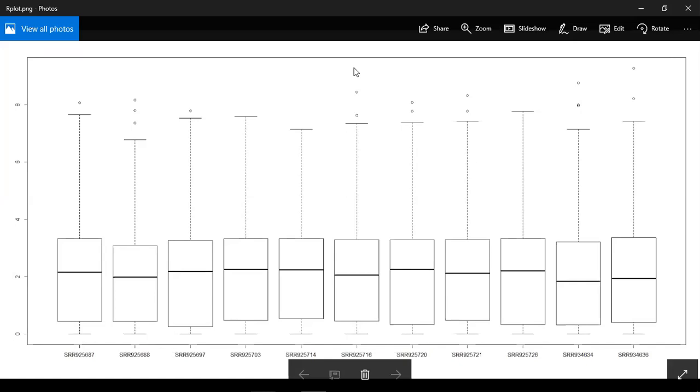Okay, so what do we conclude from these box plots of 1,000 genes? We can conclude three things. There are small differences between gene expressions. Differences are present, but they're very small. For that reason, we will want to narrow down the number of genes we're analyzing, and we will use machine learning algorithms for that in the rest of the program. We want to eliminate most of the genes that are normally or similarly expressed. So that is the first insight: we want to narrow down on some interesting genes.